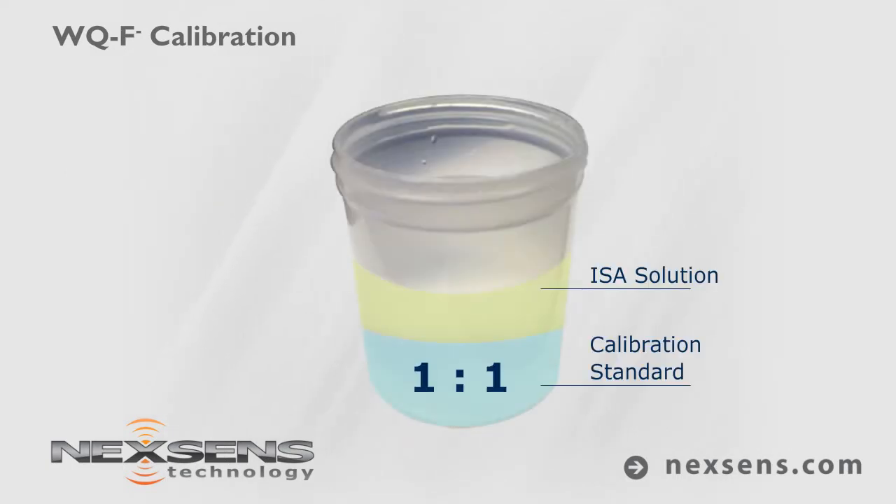For best results, use an ionic strength adjuster at a one-to-one ratio of ISA to calibration standard.